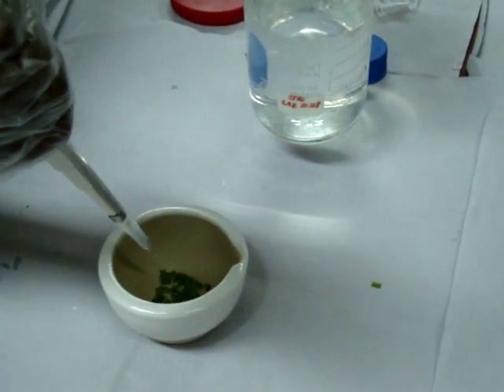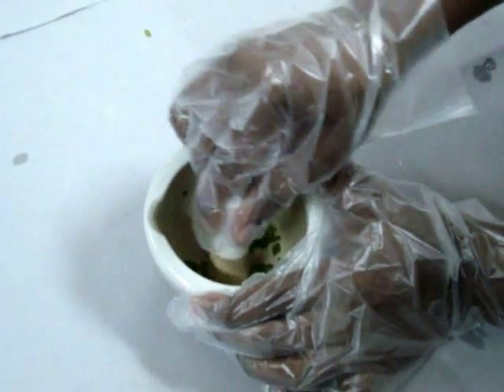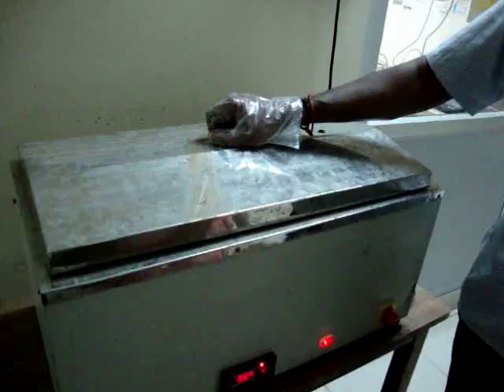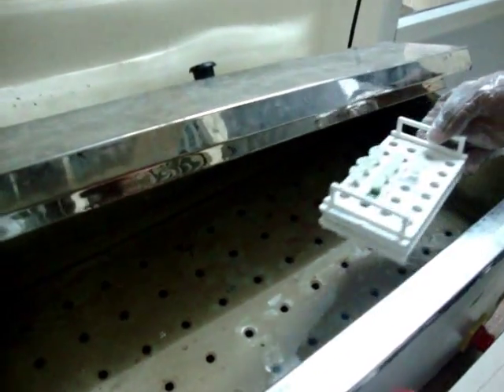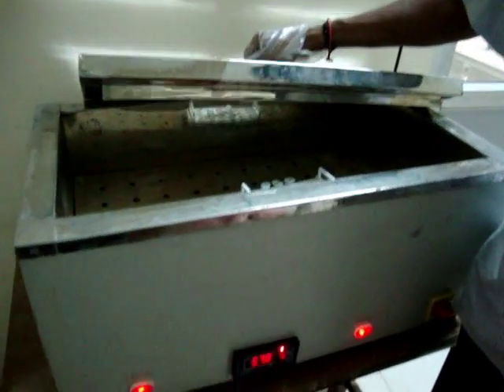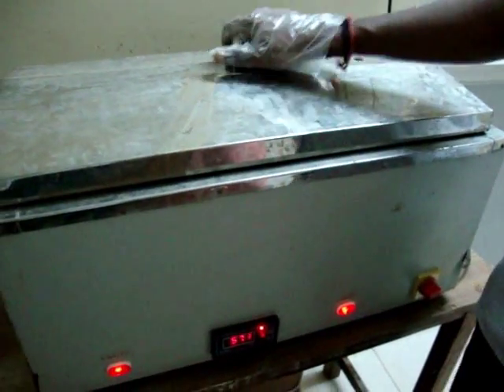The leaves are cut into small pieces and ground with CTAB buffer and transferred to the centrifuge tubes. After grinding, the samples are kept in a water bath at 65 degrees centigrade for 20 minutes. This incubation will improve the efficiency of the chemicals added.